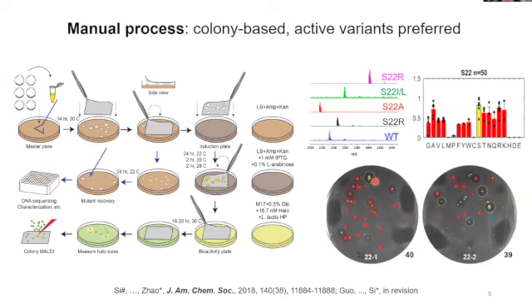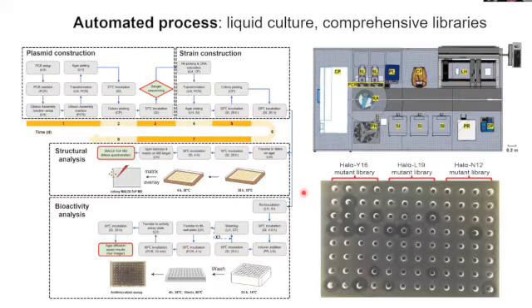So from there, we could use sequencing, mass spectrometry, and also the size of the rings, the zones, as a bioactivity readout to establish the sequence-structure-function relationships. You can see previously this manual process had huge error bars, because it's a manual process and colonies have these large variations.